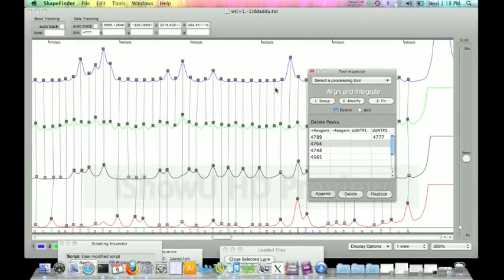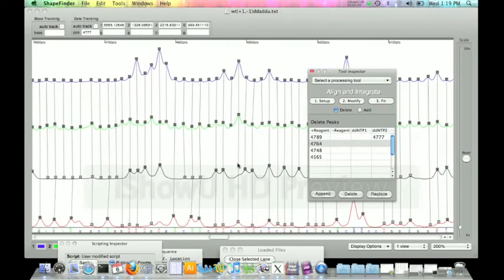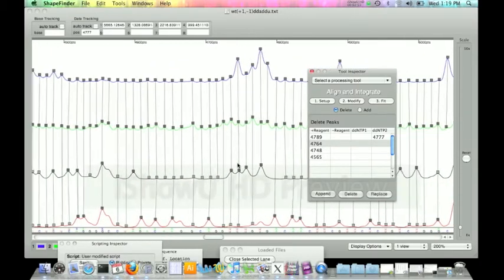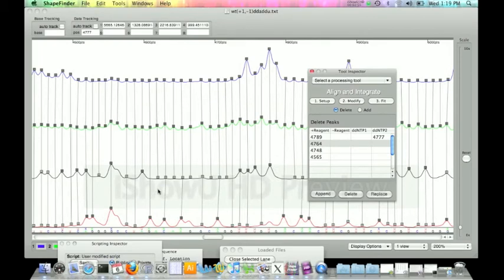So it makes sense that the number of peaks that you include in the top filter is going to directly influence your sequence down here on the bottom. So basically what you want to do is go through and look for spots where the sequence isn't exactly lined up with the ladders themselves. So if we look right in here, we can see something very clear. We have our DDA peak, which finds U's, but we look here on the ladder. Our ladder is saying, hey, there should be a U here, but our sequence itself is off by 1 position.